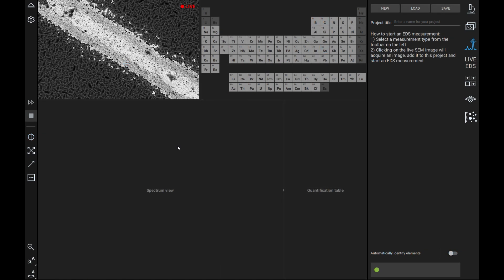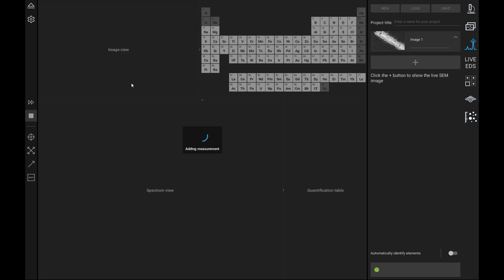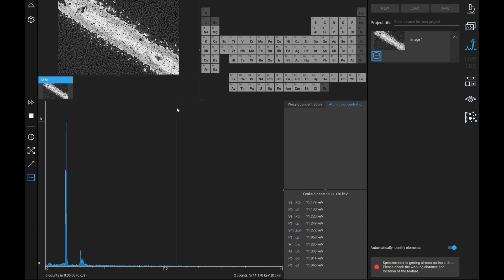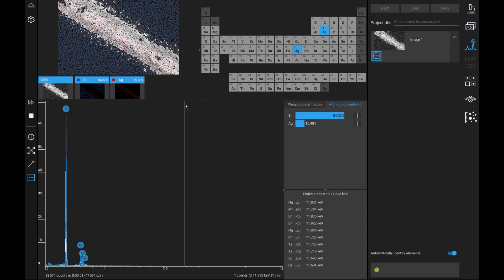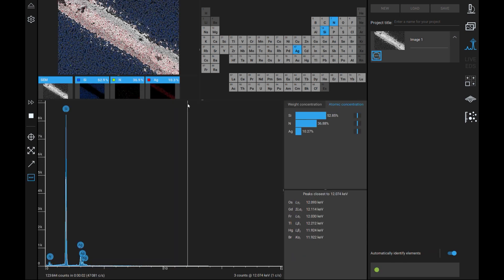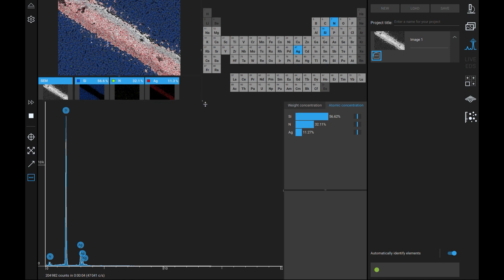Map beam intensity is our highest beam intensity and is used almost exclusively for EDS mapping, as it generates the highest amount of signal. This signal generation allows for a large number of counts per seconds, which is vital for quickly populating an EDS map.